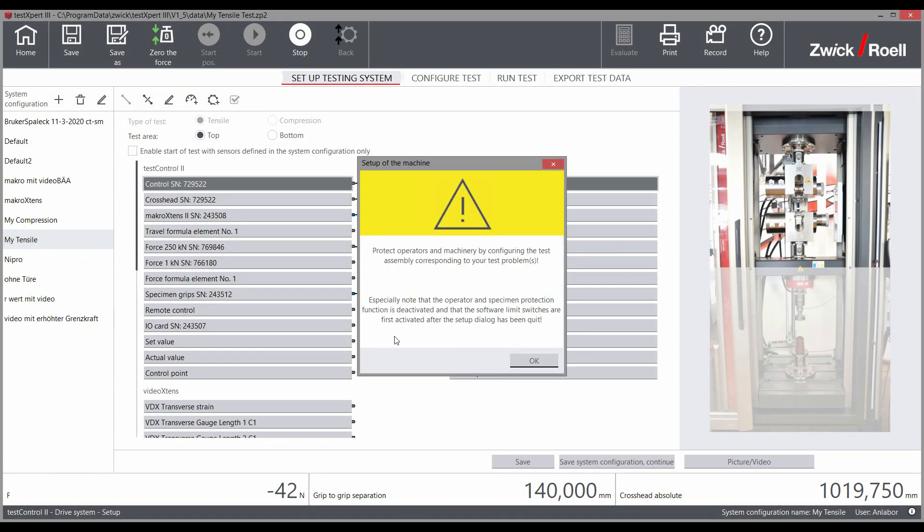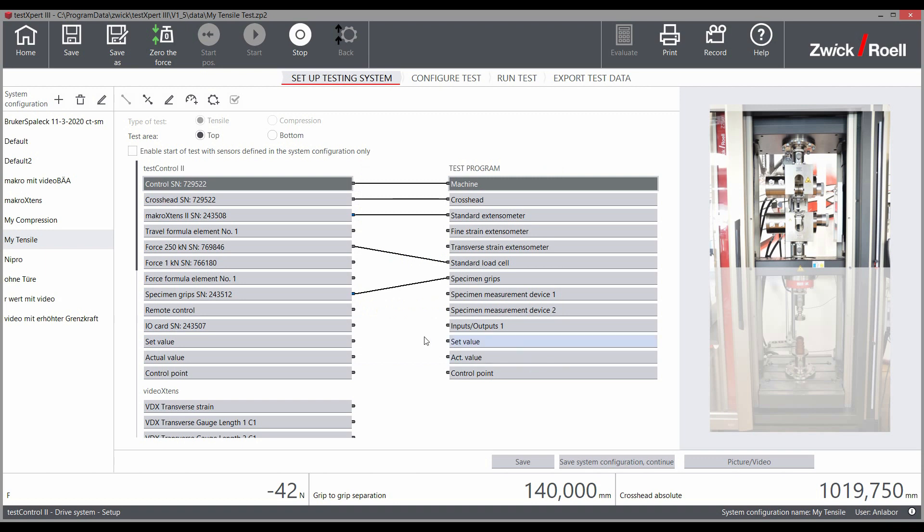Changes to the system configuration are protected by a key switch on the electronics and can only be performed by authorized personnel. With the corresponding authorization, you can set the limits for a load cell within a test, for example.